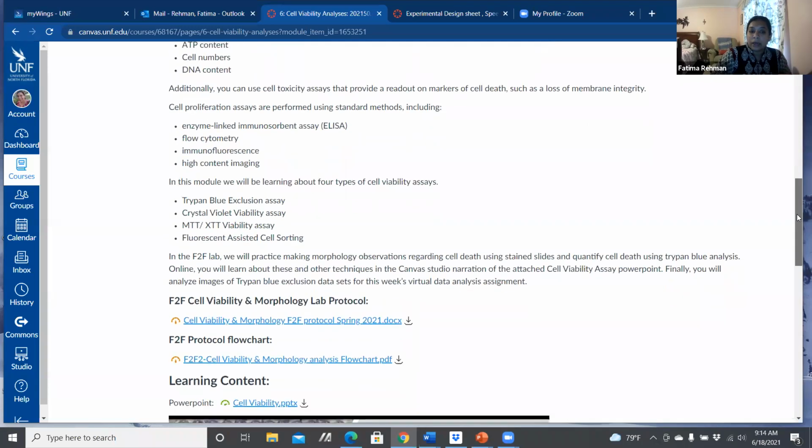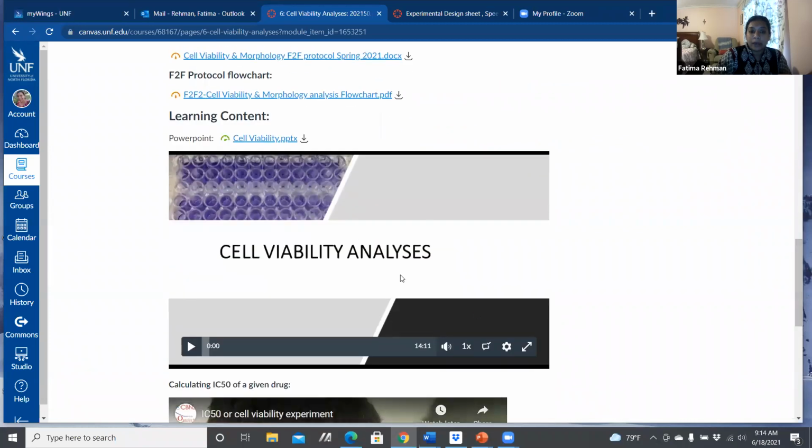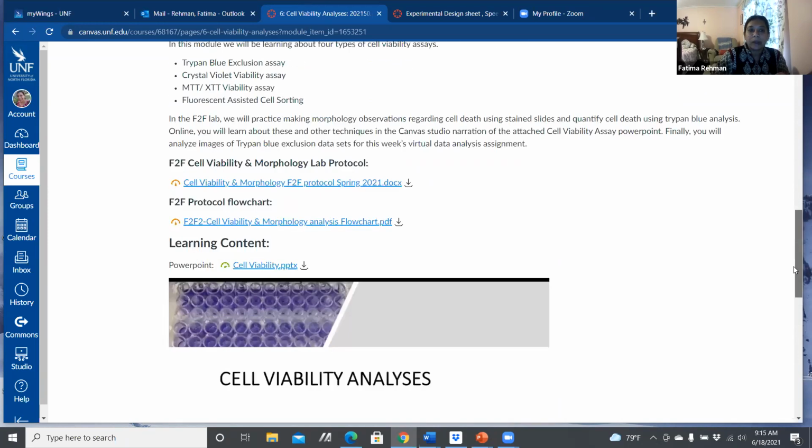There is this PowerPoint down here that goes through all these different techniques that are used to assess cell viability, cell health, and cell cycle. And there is a little presentation, a lecture by me underneath it that you can watch to learn more about it. I'm going to go over some of it in a second as well.